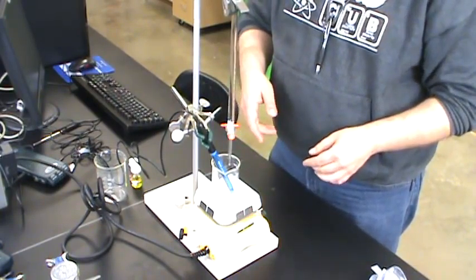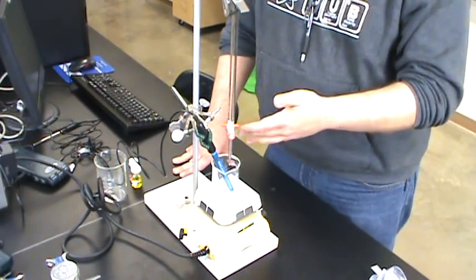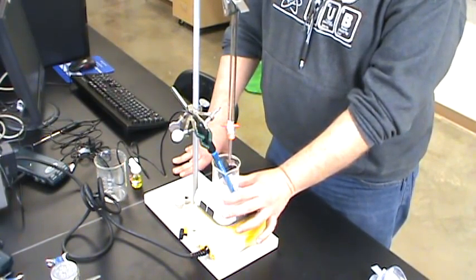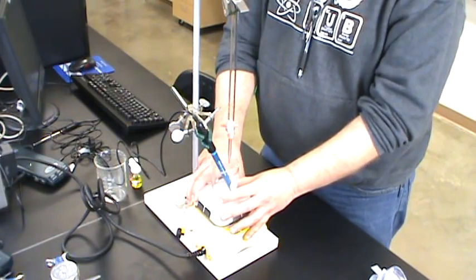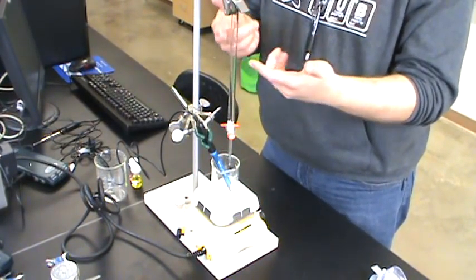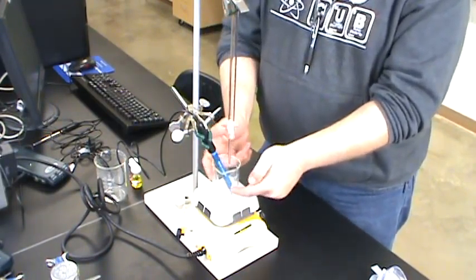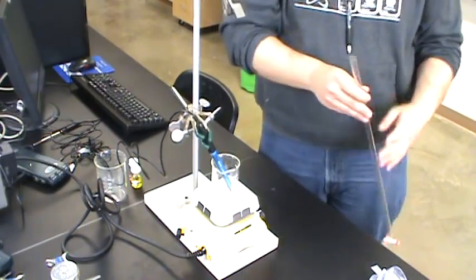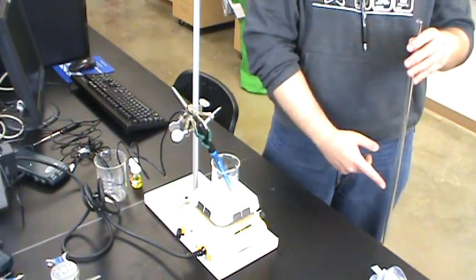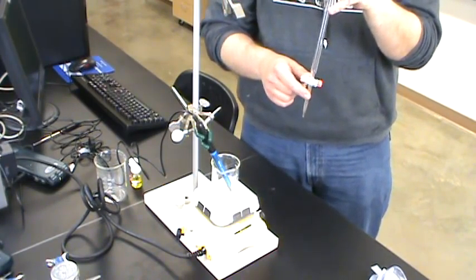Be smart about filling your burette. Anything you're going to pour, especially into the burette, should be done when it's not over your experiment that's all ready to go. I've seen people get everything set up, ready to go, lined up, and calibrated — then they go to fill the burette and spill because they're reaching way too high. When they spill, everything goes into their experiment and they have to start over. So when you want to fill that burette, take it down and fill it at a reasonable height. This way, if you spill, you're not going to spill into your experiment. Make sure you also fill the tip before you start — you can't have bubbles in the tip, otherwise your volume readings will be off.